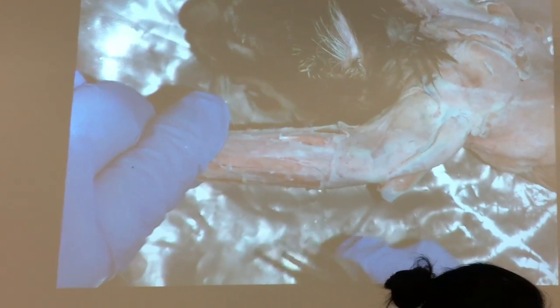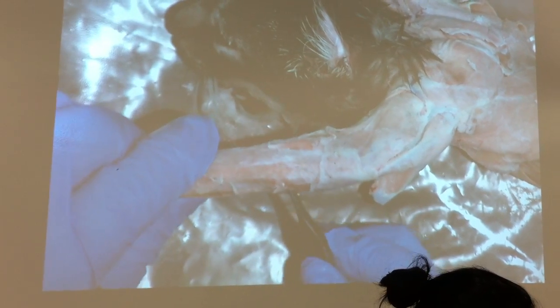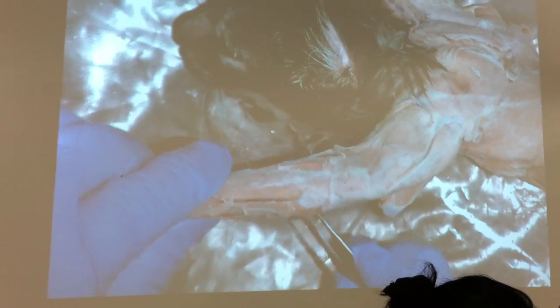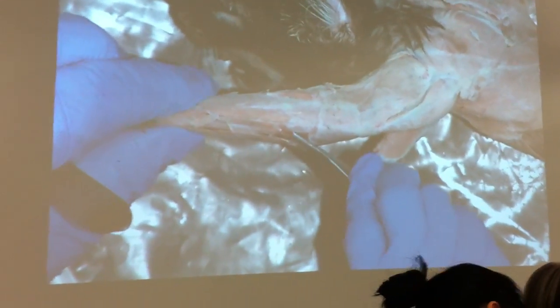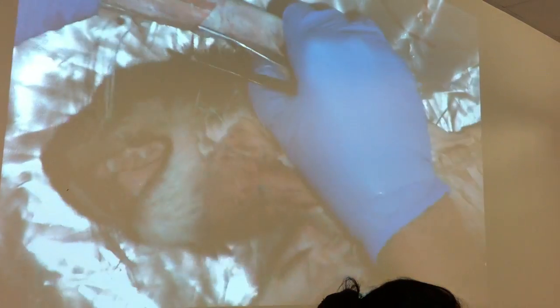The flat one right here is the flexor carpi ulnaris, the first head. I usually ask that one. Then there's the flexor carpi ulnaris — the second head is down in there. Then there's the palmaris longus.